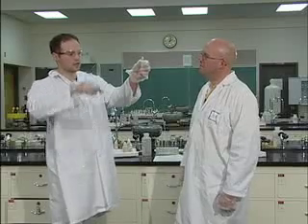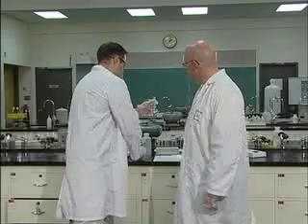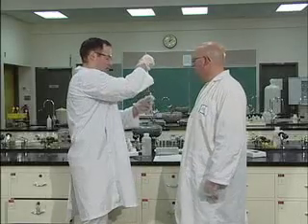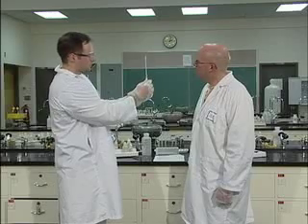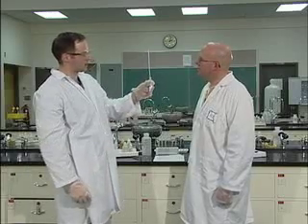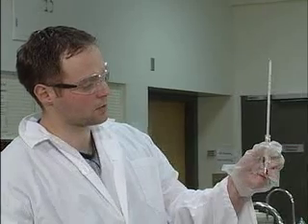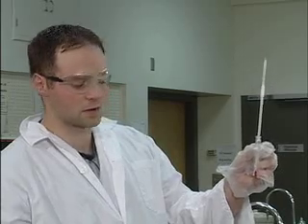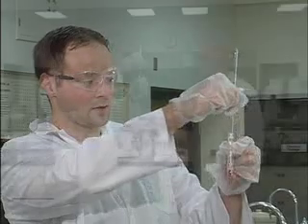So you saw a gas form, we had a reaction happen, and now we're going to check the temperature again. It's zooming up there, and we definitely have a temperature change, up to about 36 degrees centigrade, which is quite a bit warmer than room temperature. And there's no more magnesium in there, the magnesium has gone into solution.